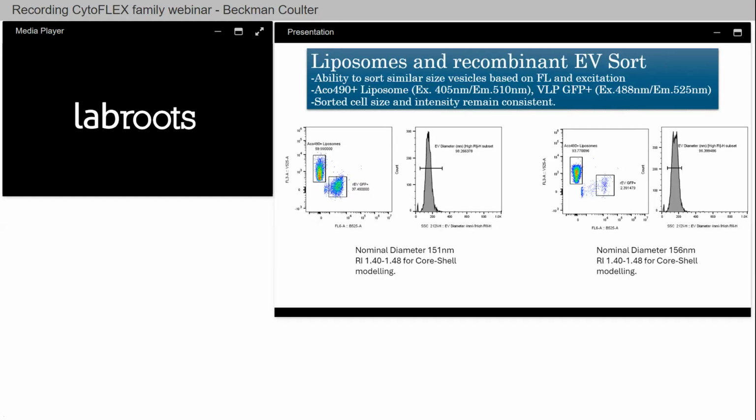So you can see here, we started looking at the liposomes with the recombinant EVs, started mixing these things. We're going to mix a lot of stuff together just to try to separate it. Here we mixed them together and we tried to isolate our liposomes by themselves. And again, just putting numbers there so that we get an idea of no effect on actually what is happening within the sorter to the particles, and that we are getting these high numbers and seeing some of that background also. So we're not ignoring the noise, we're just diminishing its effect on our total data.